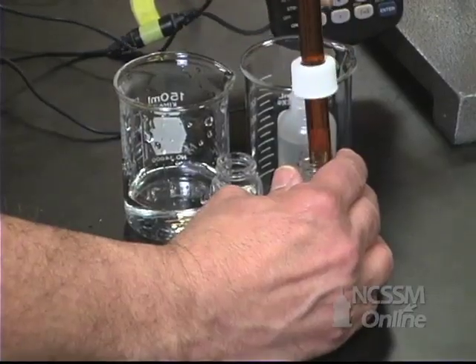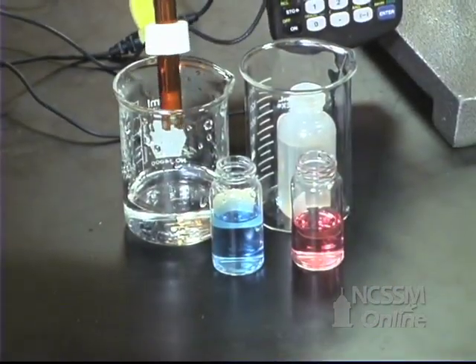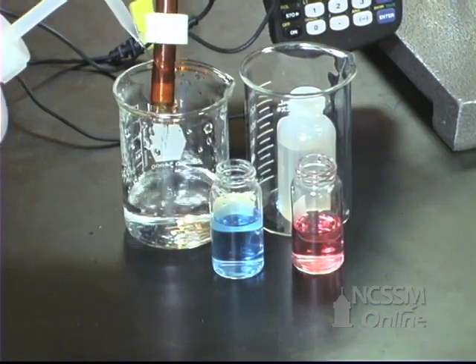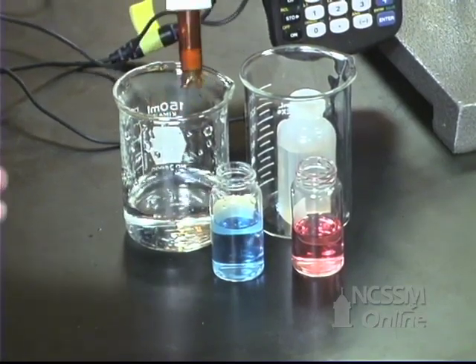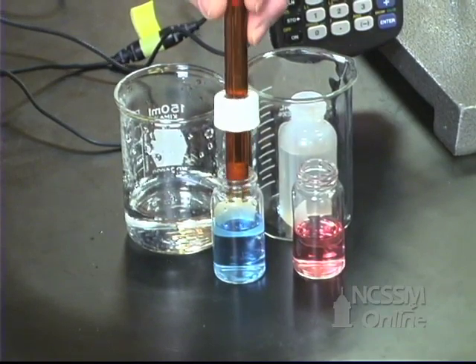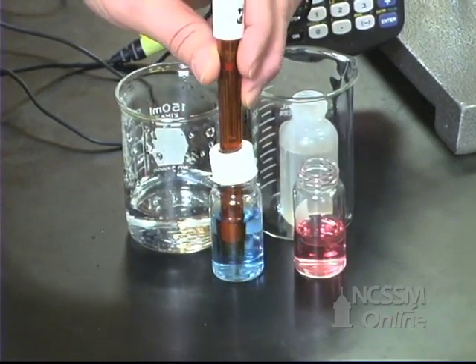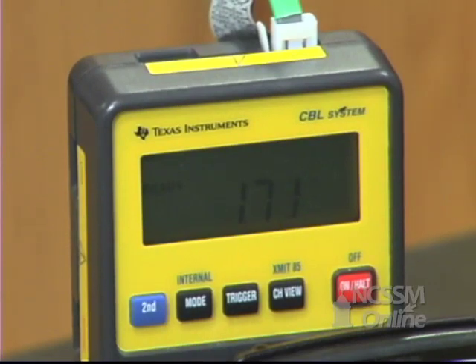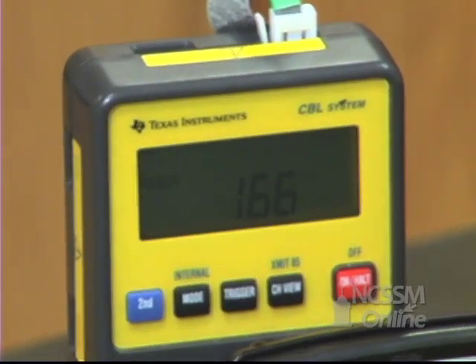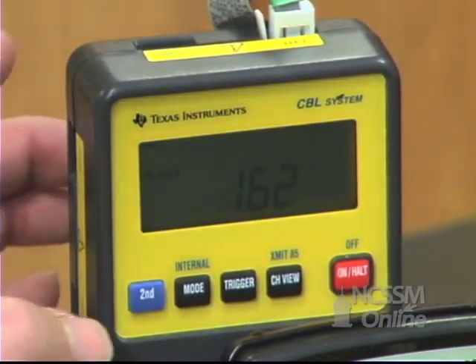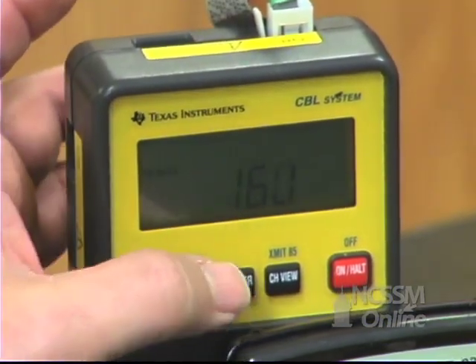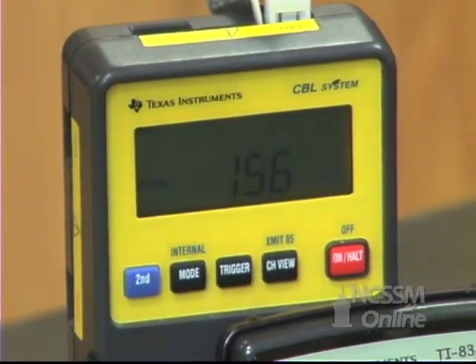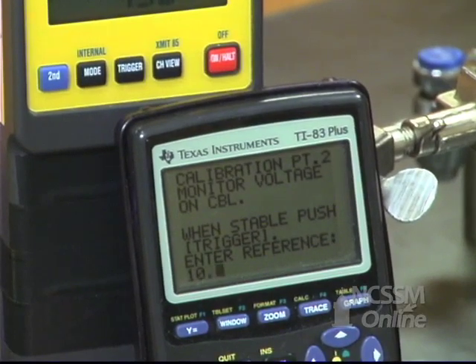We're going to rinse the probe with distilled water and put it into a pH 10 buffer solution. We're going to wait until our CBL reading becomes stable, then press trigger on the CBL and enter a value.